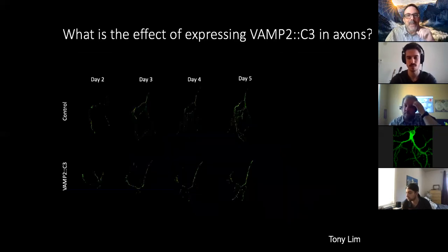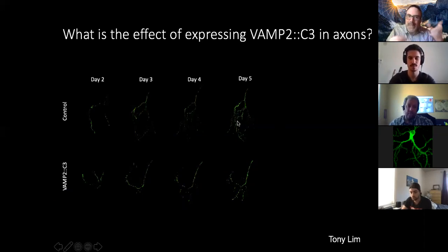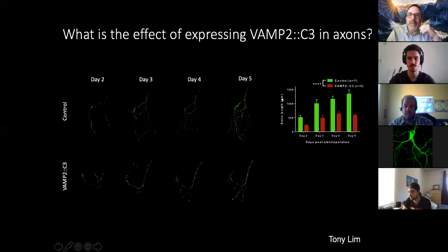And so what happens to those cells? What Tony saw was that over the course of a few days, the complement C3 expressing cells actually grew considerably less than the control cells, suggesting that there may be some interaction then with the microglia. So this is the quantification. I don't know if it's large enough to see, but you can see that the size of the arbors, and these are pretty high ends, was much smaller for the complement expressing cells than for the controls.